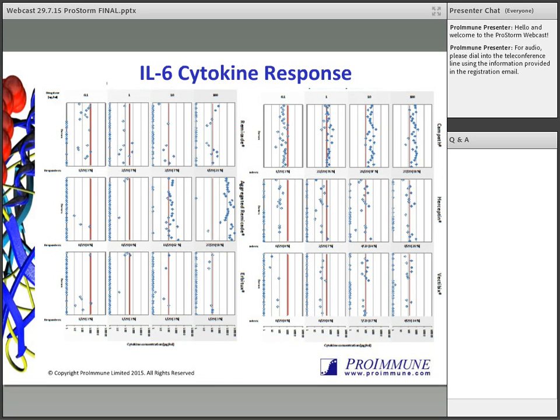And as you can see, at the 3 highest drug doses for Campath, the IL-6 responses were quite high and considered positive in 78, 97, and 96% of the donors. So you can see that this comparator works really quite well in the system and is consistent with what has been detected in the clinic.